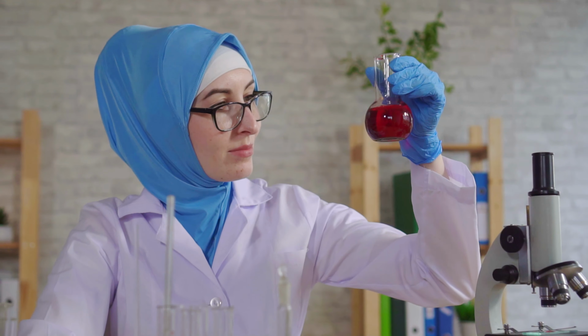The holes in the filter paper are too small for the soil particles to pass through, so they get trapped while the liquid part drips down into my flask.